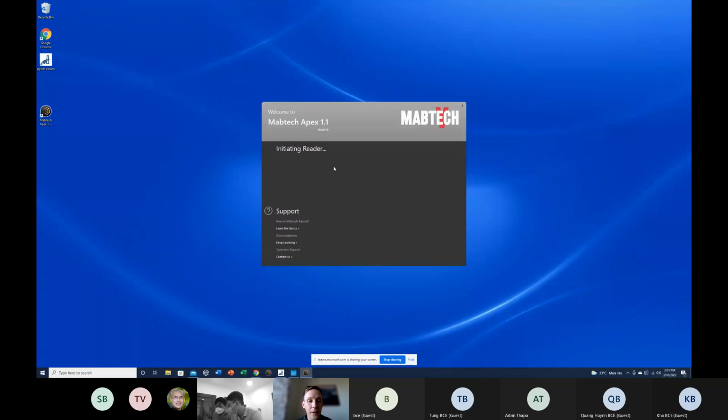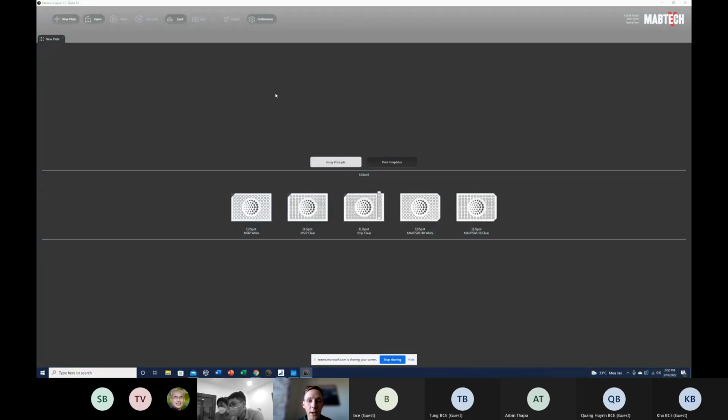Should we open the ASTOR, turn on the ASTOR? Yeah, you can do that. You can do it already now. Okay. So turn on the ASTOR on the front. Now you can log in here, ABC 3, and then open workspace. Okay, now it's better.